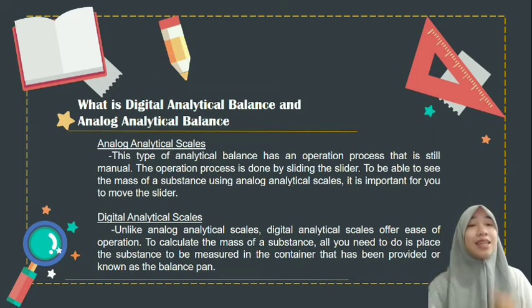While the digital analytical scales, unlike the analog analytical scales, offer ease of operation. To calculate the mass of a substance, all you need to do is place the substance to be measured in the container that has been provided, known as the balance pan.